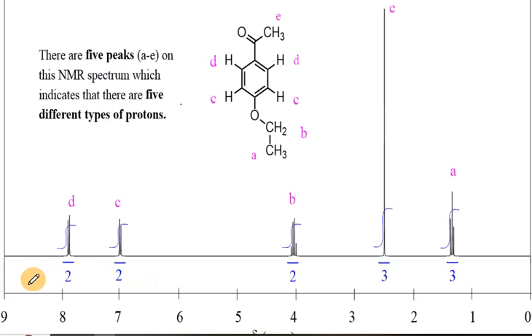The region of the higher frequency, which is at the left side where the arrow shows here, is called the downfield. Then that of the lower frequency at the right side here is called the upfield. Now the upfield here is displayed by nuclei or species with higher electron density. And downfield here is displayed by nuclei with a lower electron density.